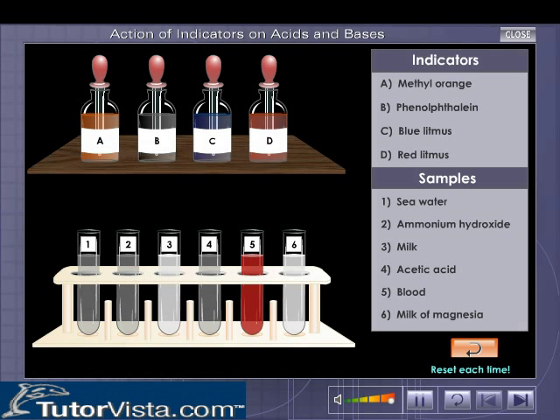Similarly, repeat the steps with the other indicators. Check your results.